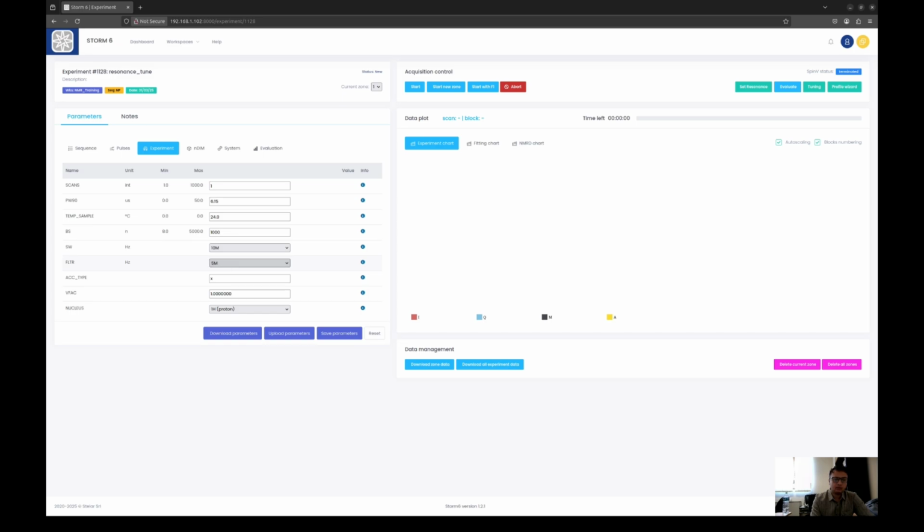And then here are some filters. So we have some digital filters. The 5 MHz is basically the open filter. Then we have some other filters which we will use during our experiments. What I generally prefer is 1.25 MHz, but we can increase and decrease the bandwidth of the filter based on how much noise we want to remove, or what window we want our acquisition to be in.